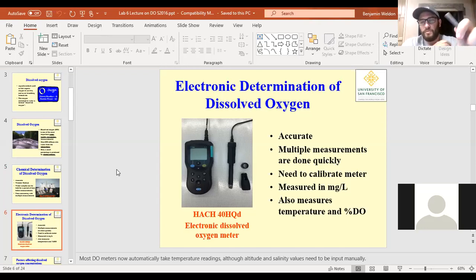That part goes in the water, and that's where you actually measure it. These are very accurate tests as long as you calibrate it beforehand, to a known standard so that it knows exactly where it's starting and can give you an accurate measurement. If you're not calibrated right, you will never get the right answer. It's usually very quick.